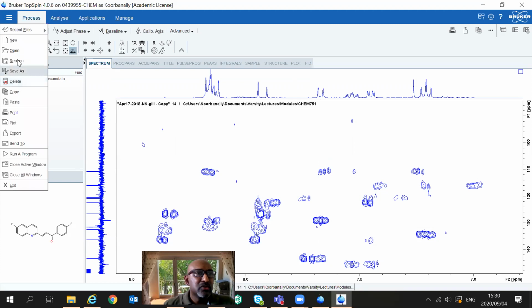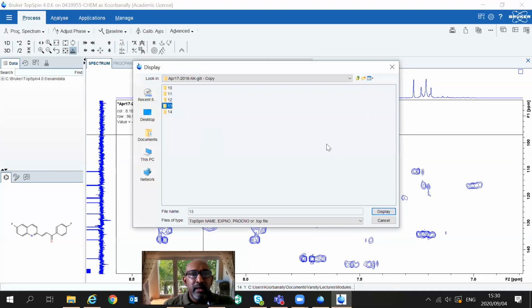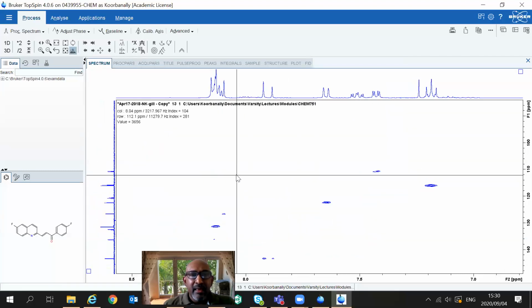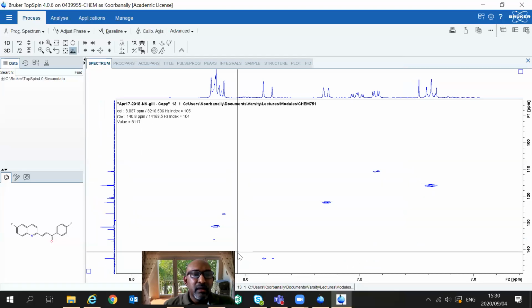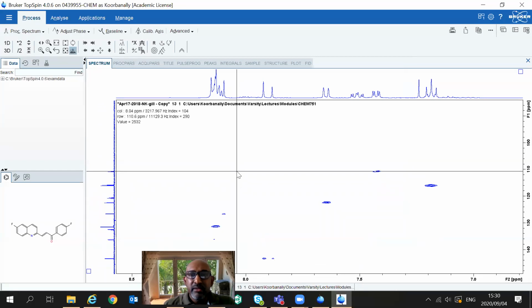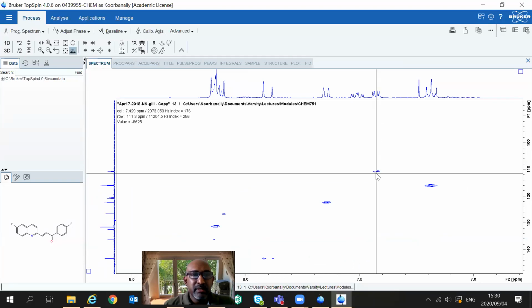I'm going to go back to my HSQC. One is around 110 and the other one is around 142.